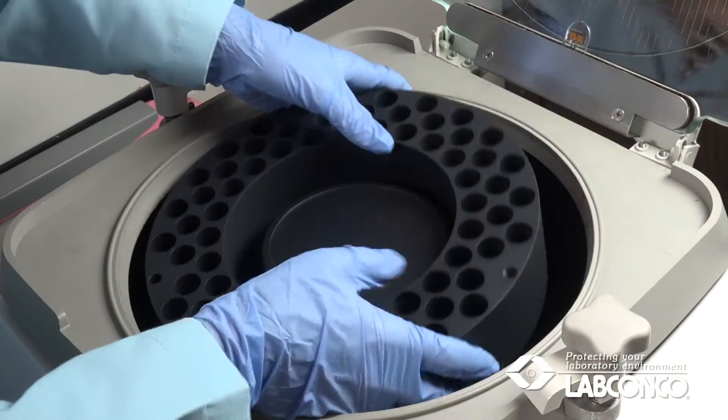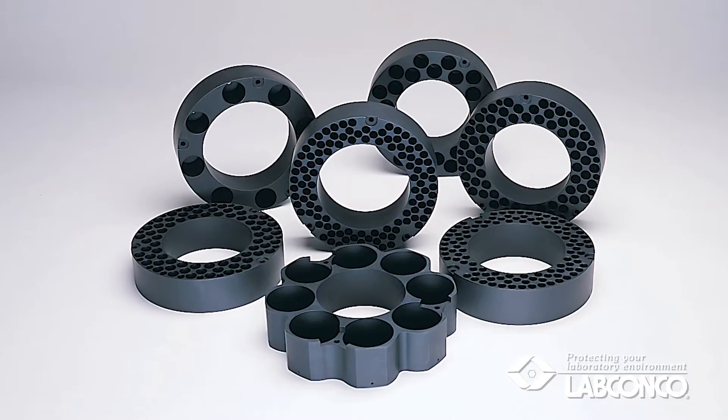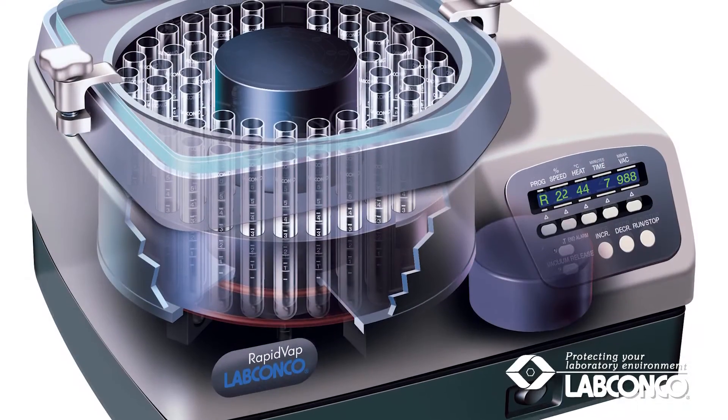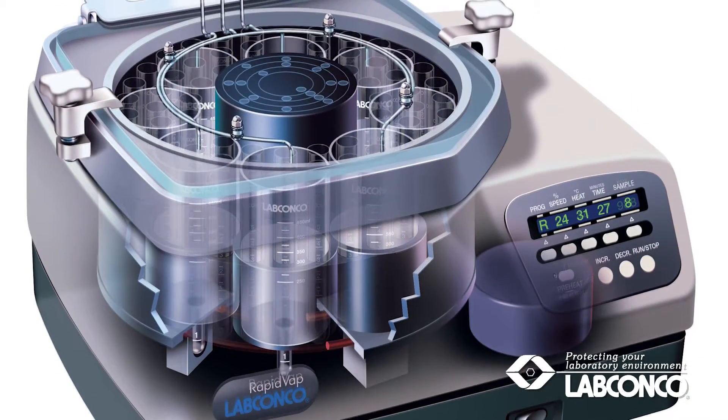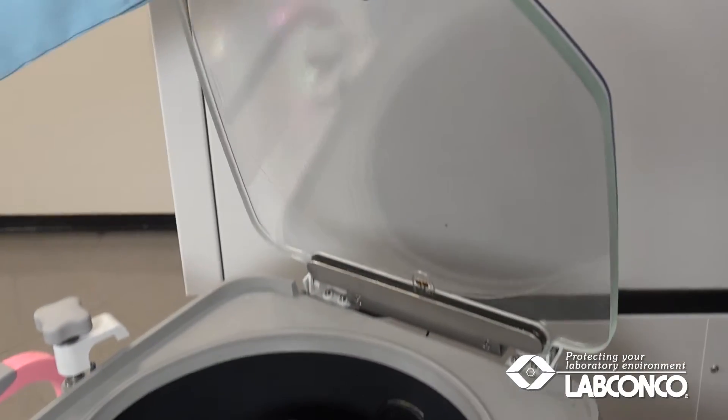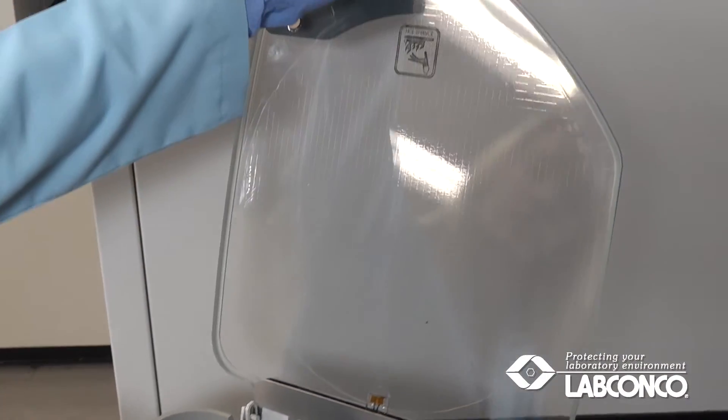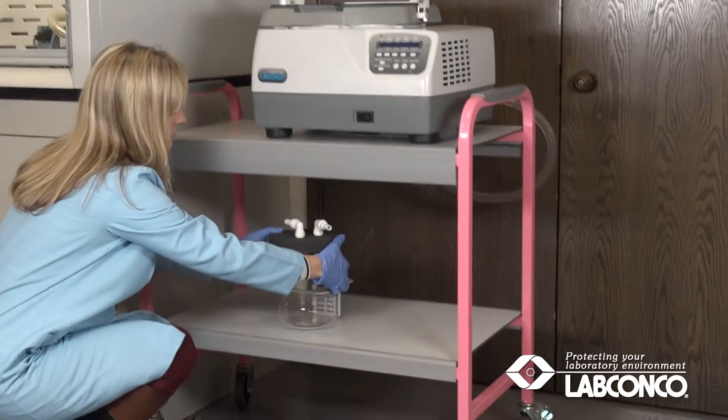The vacuum system requires a block. Several blocks designed to hold a variety of glassware sizes are available. When using low boiling point solvents, a lid heater is recommended to prevent moisture from condensing on the lid.